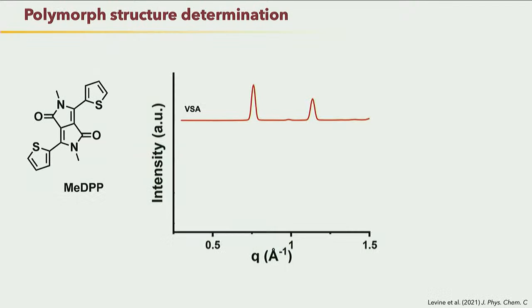One more really cool thing that you can do in the small molecule world, I guess technically in the protein world too, and I'll finish up with this so there's time for questions, is looking at polymorphs. This is pretty important for pharmaceuticals because polymorphs have different activities, and sometimes samples will have more than one crystal form in them. Well, you can solve multiple crystal forms from the same sample using MicroED, just as long as you find those crystals in the sample. So that's what we did in this case here.